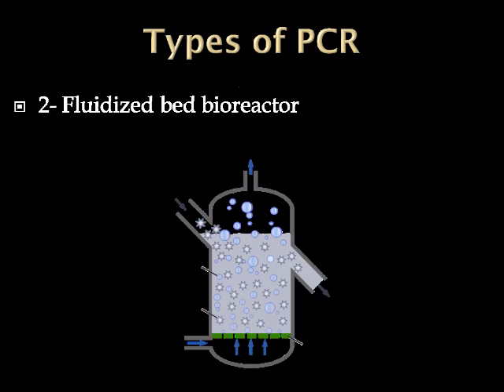Fluidized bed bioreactor: uniform particle mixing. Due to the intrinsic fluid-like behavior of the solid material, fluidized beds don't experience poor mixing as in packed beds. The complete mixing allows for a uniform product that can often be hard to achieve in other reactor designs. The elimination of the radial and axial concentration gradients also allows for better fluid-solid contact, which is essential for reaction efficiency and quality. Uniform temperature gradient.